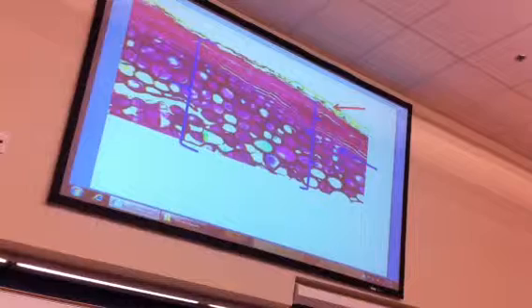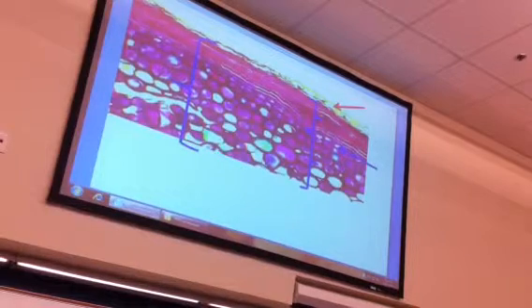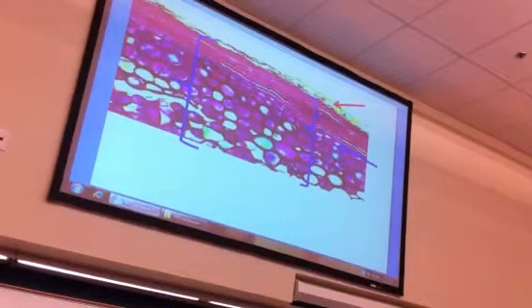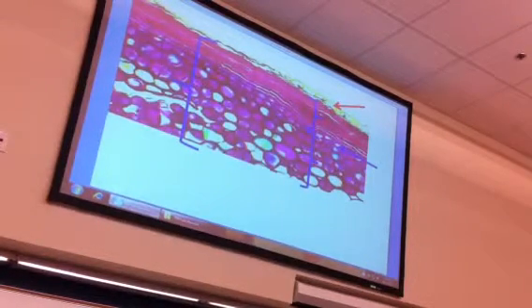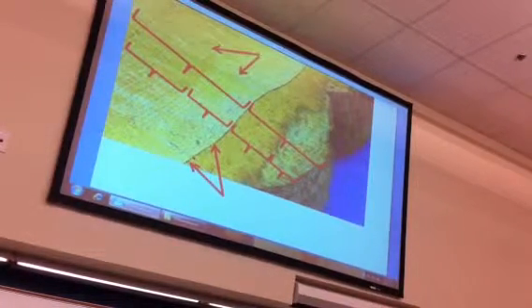What's the layer of cells? That's the first layer of cells that you could say is very distinctly different. They actually look like cells compared to these pancakes. What would this single layer be right through there? Cork cambium. Cork cambium is the meristematic layer that formed all this. And then all the rest of this is cork parenchyma. Collectively, many layers thick is the periderm, and in this older tree, that would be all of this. If we went back to this magnification, it would be pretty much all of that right in there, although it's harder to see at this magnification.